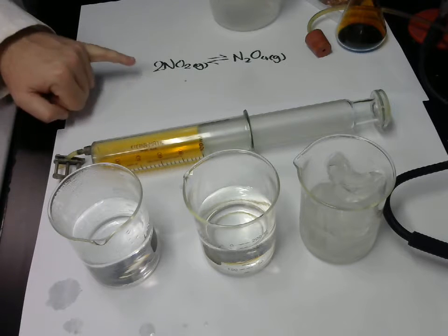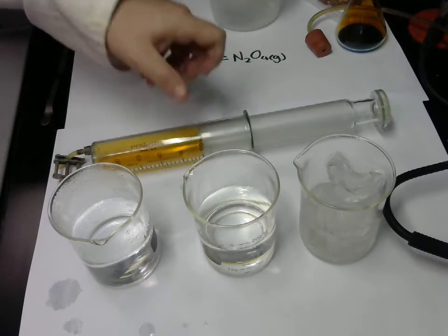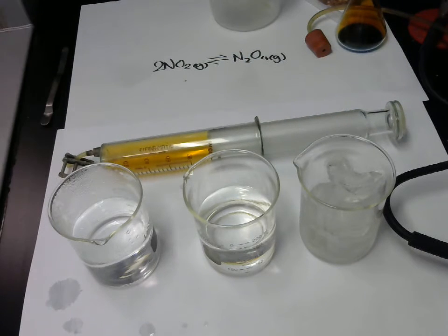The nice thing is, NO2 is brown, N2O4 is colourless. So the browner this gets, the more NO2 is being made. Which reaction is that, forward or reverse? Reverse, good. So it favours the reverse reaction if it goes dark. If it goes lighter, it's favouring the forward reaction, because that NO2 is being combined to become N2O4, which is colourless. So that's the background.